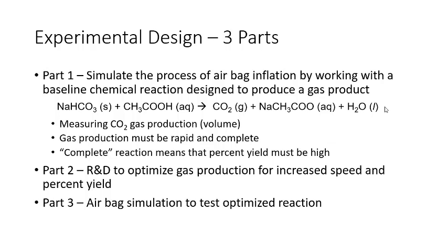We're going to observe the amount of time that it takes to produce the gas in this process, and we're going to observe the quantity of gas in volume that is produced. So in part 1, we're just going to be getting used to working with this experimental setup, and we're going to figure out the conditions for a baseline experiment.